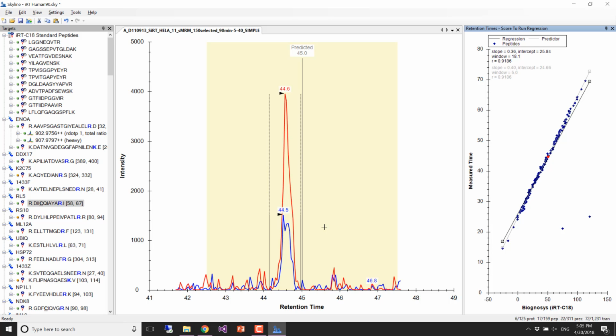Originally, back in the day, we talked about maybe doing it based on the width of the peak. There are some peptides that, you can't get around it, have 1.5-minute wide peaks, and we'd rather give them 8-minute windows or something like that. And we just never did that. It would require some way of saying the retention time window isn't a constant; it's a function of something. We just never did that work.